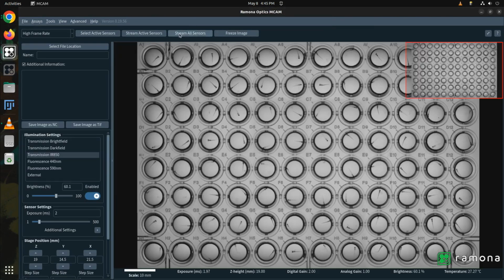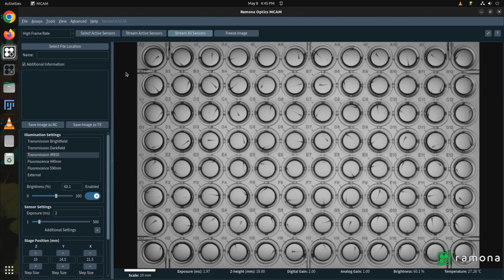In this tutorial I'm going to show you how to acquire a different type of assay called the visual motor response, or VMR. The VMR is a popular assay that implements alternating phases of visible spectrum illumination and darkness. During the transition from light to dark phases, the zebrafish are startled and their distance traveled, or the number of fish that respond to the stimulus, can be quantified as experimental endpoints.